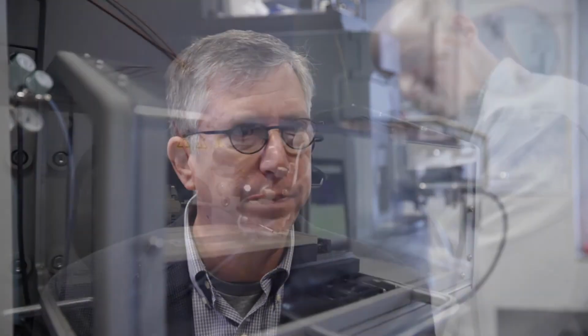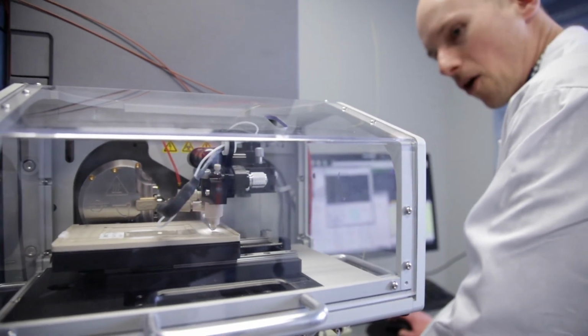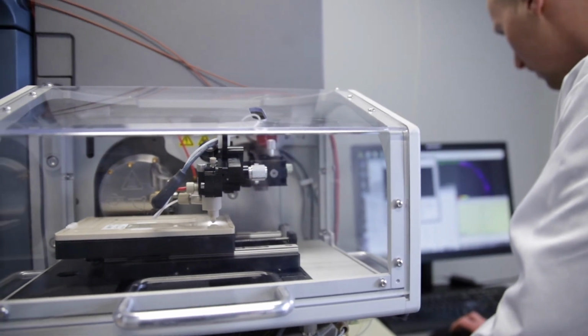We can start to make signatures that distinguish healthy from diseased tissue, in this case cancer from benign. And because we overlay the chemical fingerprints with the kinds of things that pathologists are used to using for diagnosis, we can develop these signatures in a confident way to understand exactly which cells are making which chemicals. And we now have a system where we can build an encyclopedia of disease using DESI on well-characterized tissue.